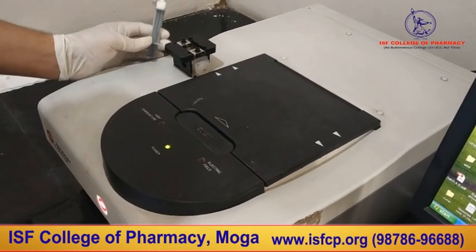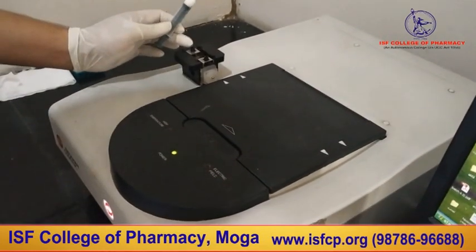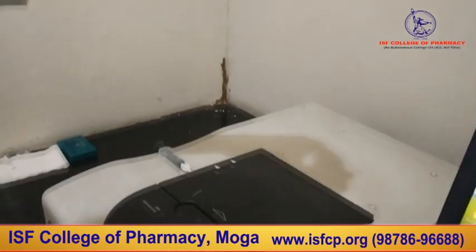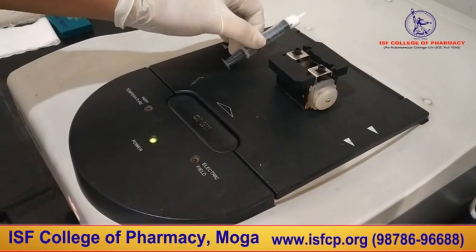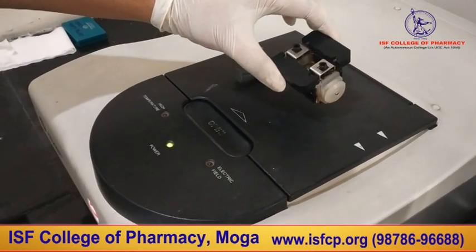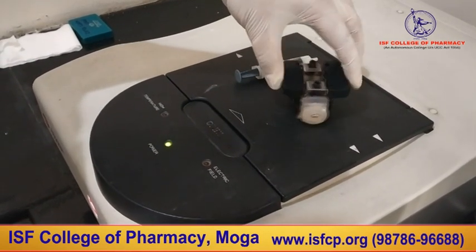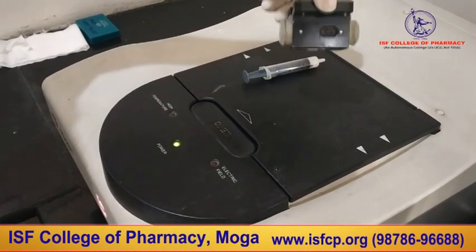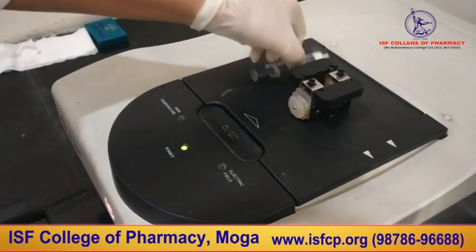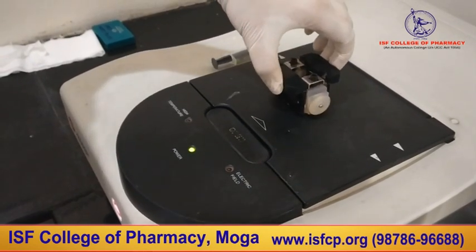We have already filled our sample through this 5 ml syringe, inside these tubes, and this apparatus, the Zeta potential measurement socket, is already filled with our sample. As I already told, there should not be any kind of air bubble inside. So before placing this socket, we already made sure that there is no air bubble.